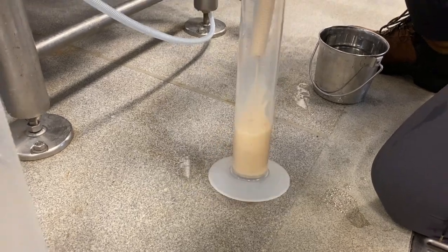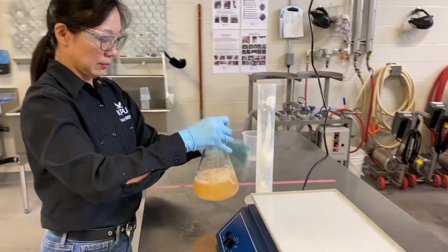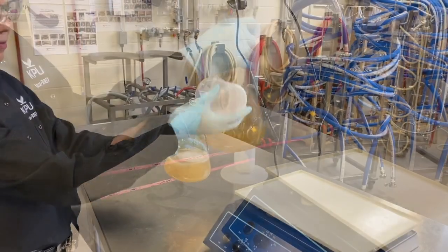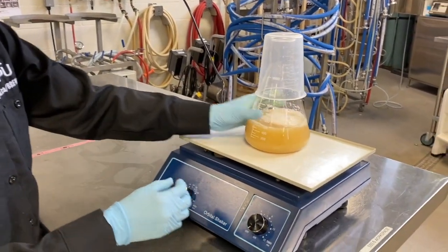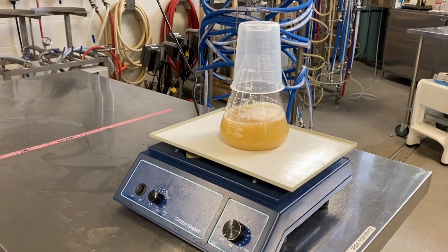Collect about 100 milliliters of fresh yeast slurry and mix with 500 milliliters of the aerated wort sample. If you have a lab shaker, use a 1 litre Erlenmeyer flask as your wort container. Start the shaker and let it run overnight.